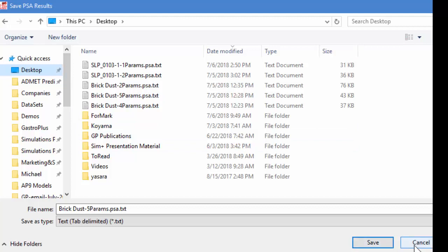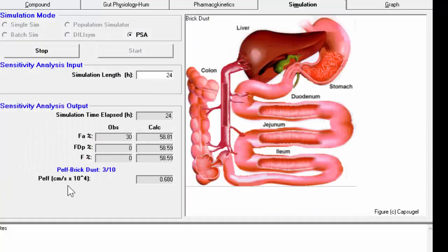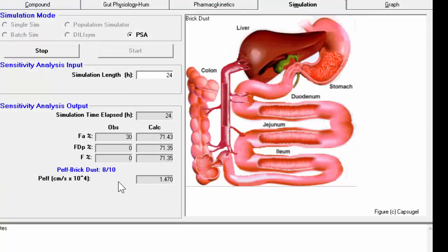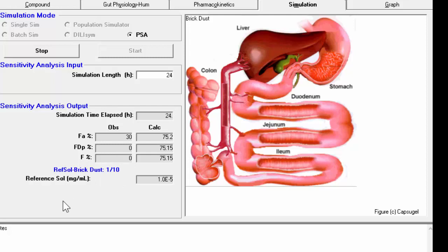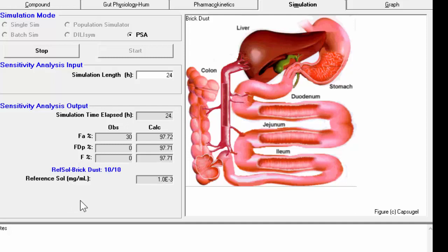If I hit Cancel at this point, it will still perform the parameter sensitivity analysis. It just won't save it to a text file. So once we exit Gastro Plus, then we won't be able to look at those values. And that's why I typically save them. And then you see that it's going through each one of these parameters and running 10 simulations for each of the parameters. So that was the path. Now it's going through the reference solubility. And the program's working fairly quickly. And so I'll just let it finish.